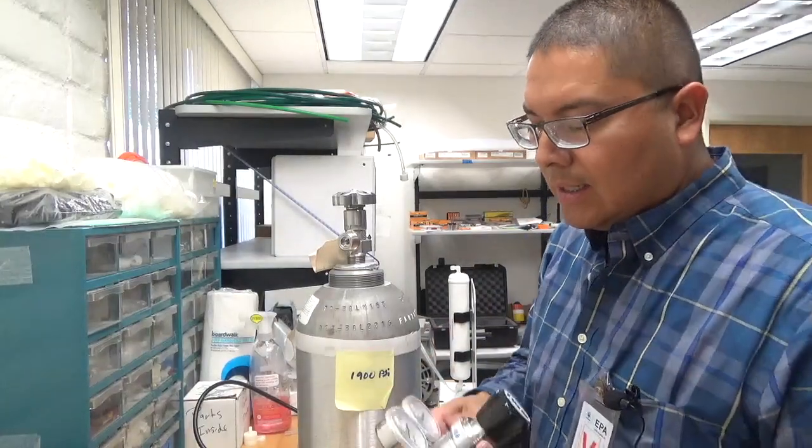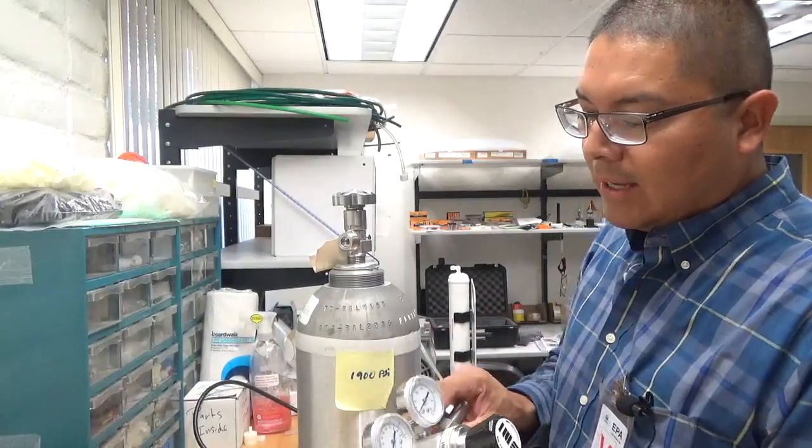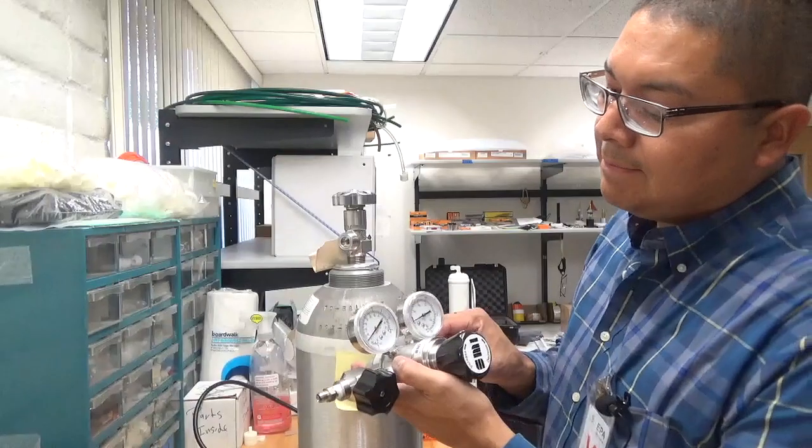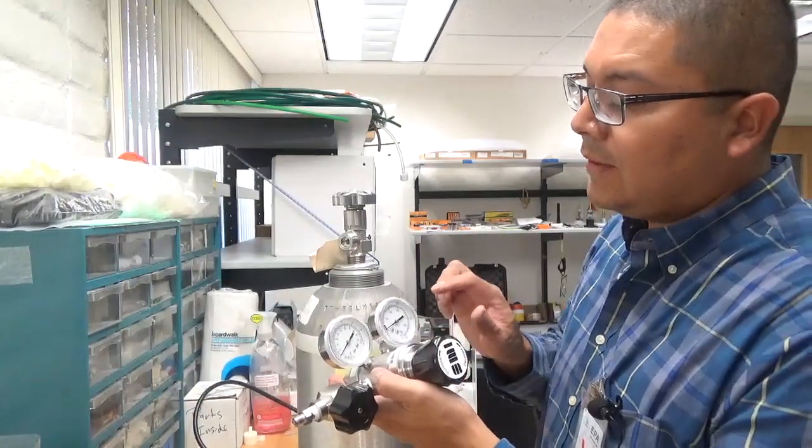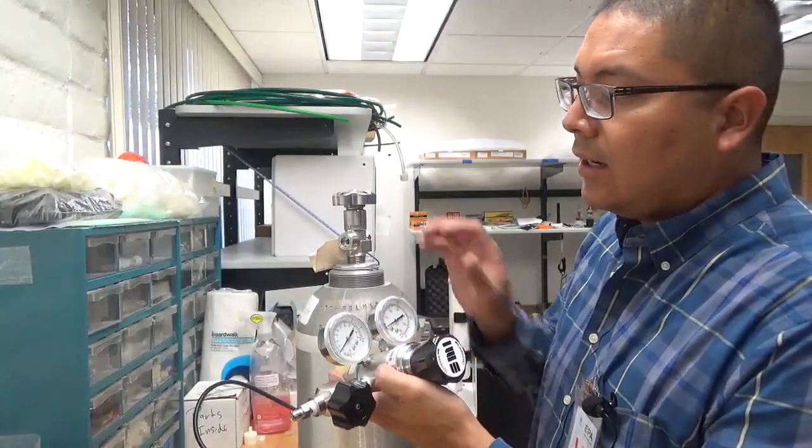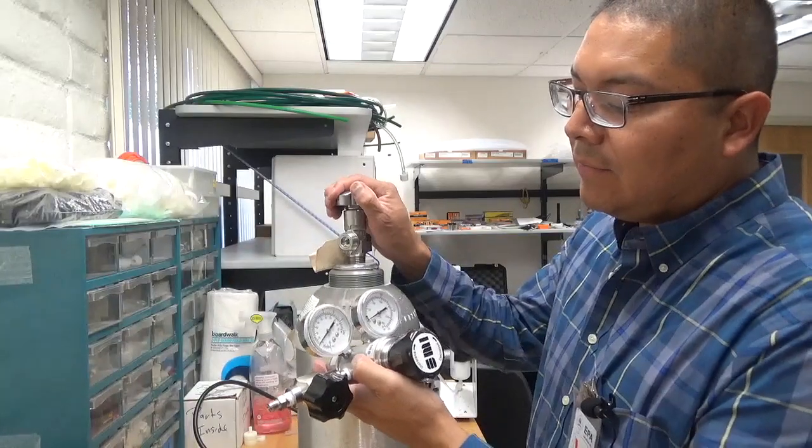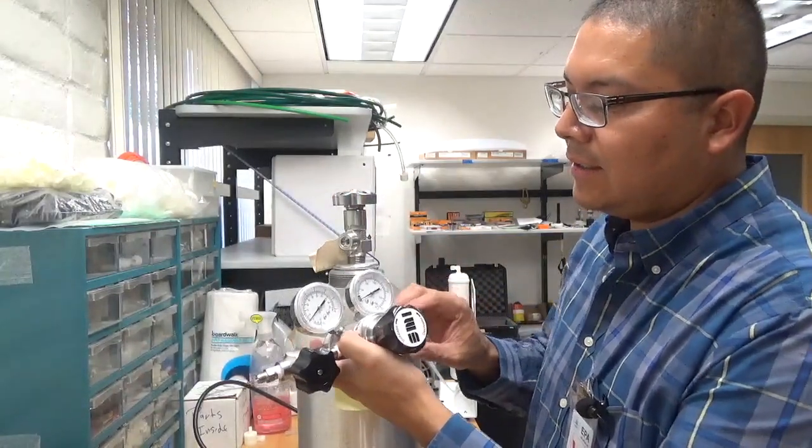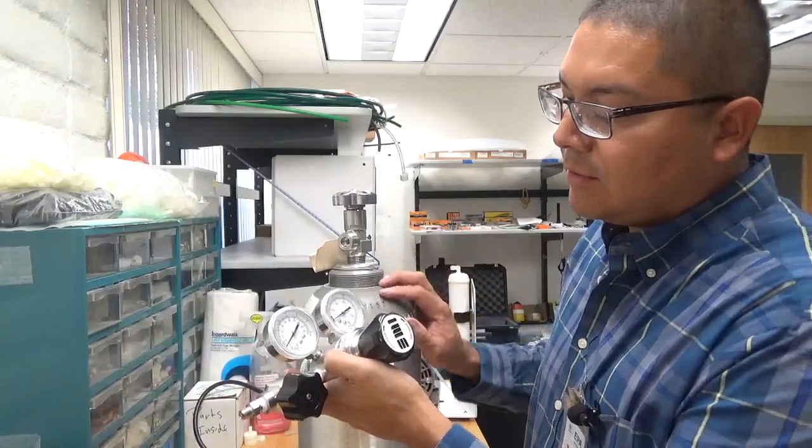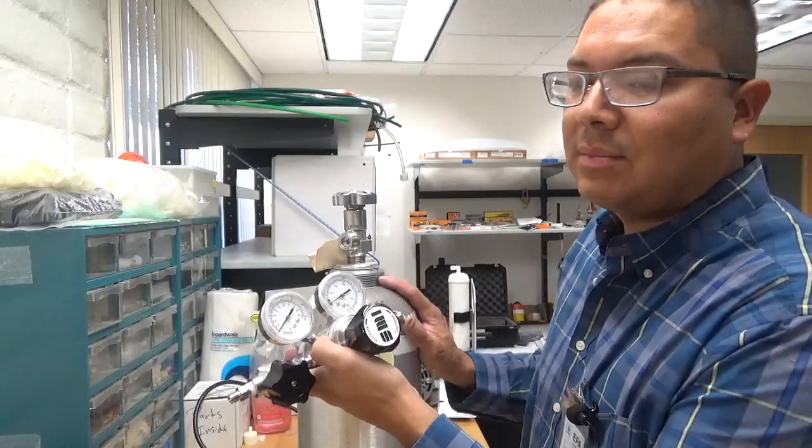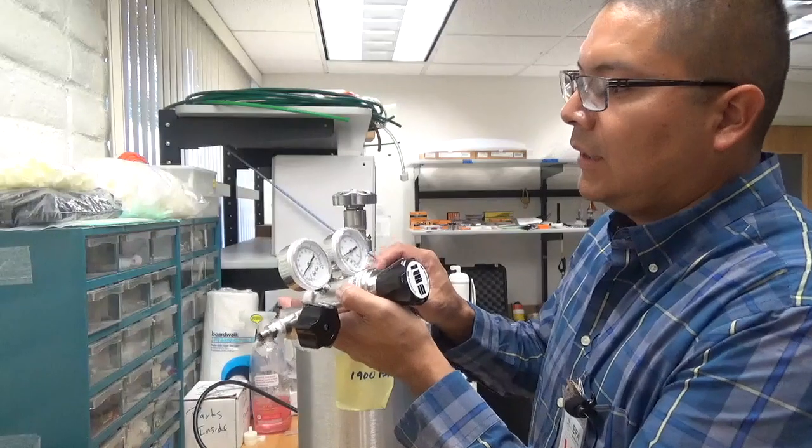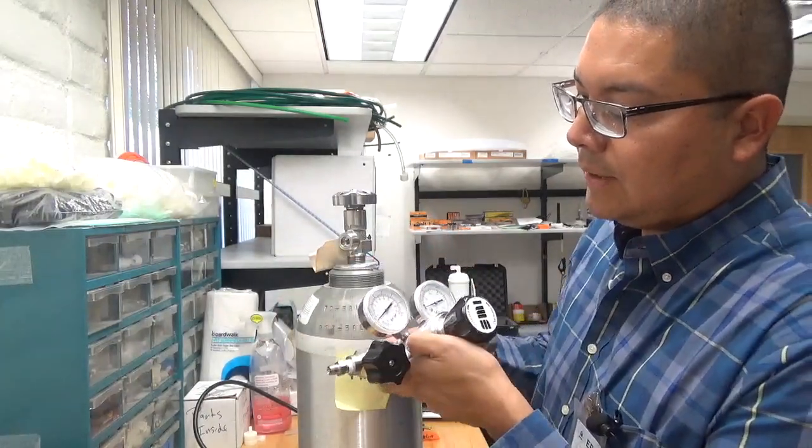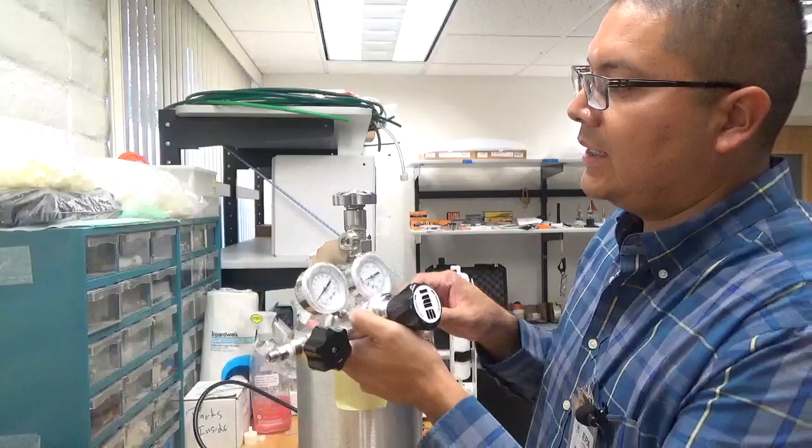Here is your gas cylinder regulator valve. You have two gauges. One gauge is for the gas cylinder valve and it tells you the pressure that's within the gas cylinder. This gauge goes from zero to three thousand psi. And the regulator output valve goes from zero to a hundred psi.